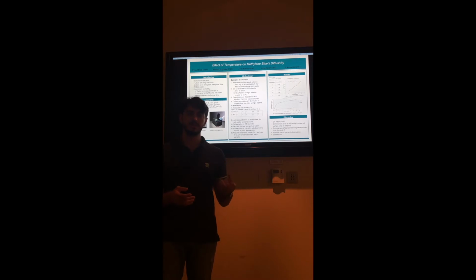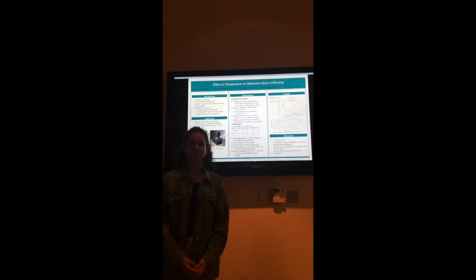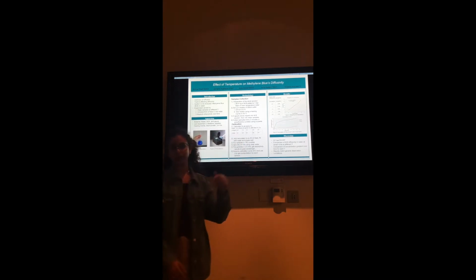The cuvette is important because later we're going to place it inside the UV as we have previously shown in the apparatus. And now I'm going to leave you for the second part in which my teammate Jumana is going to discuss the calibration process. Hello everyone, my name is Jumana Zghayar and I will continue after my teammate Anas who talked about sample collection, and I will be talking about the calibration process.